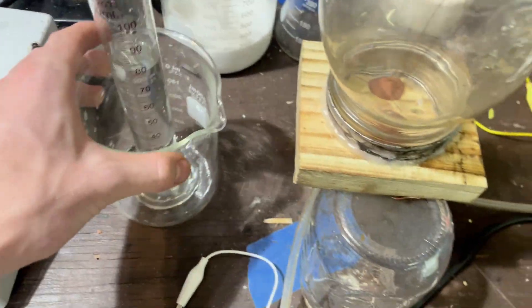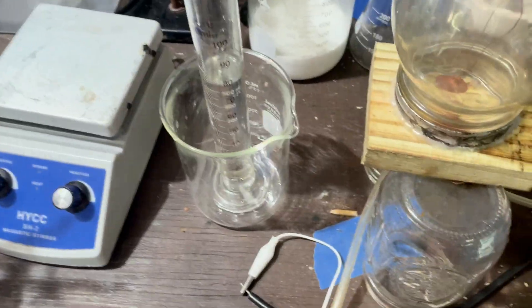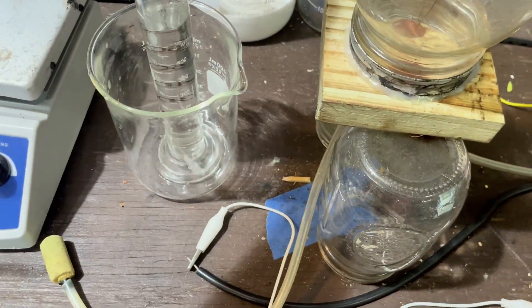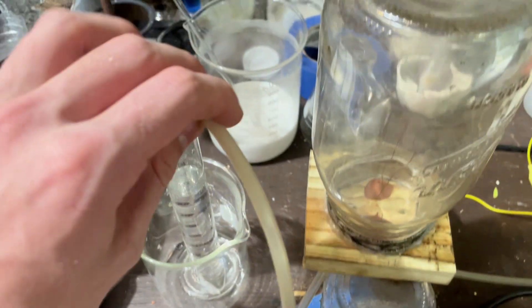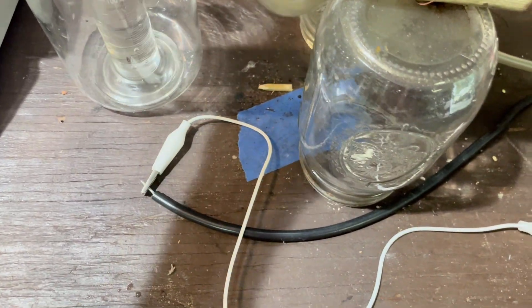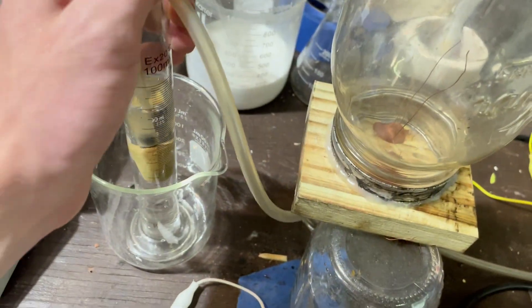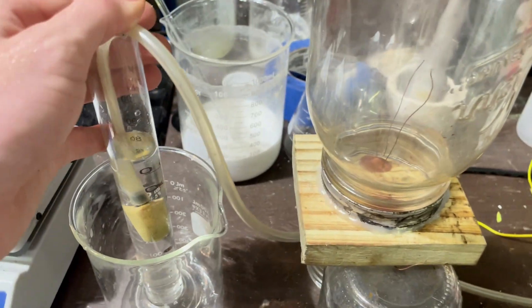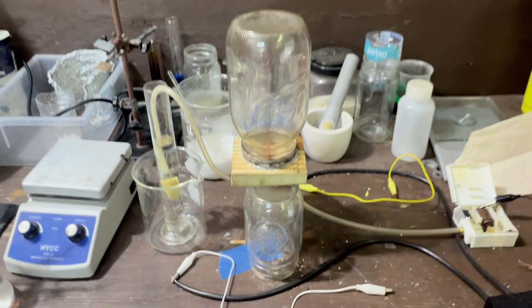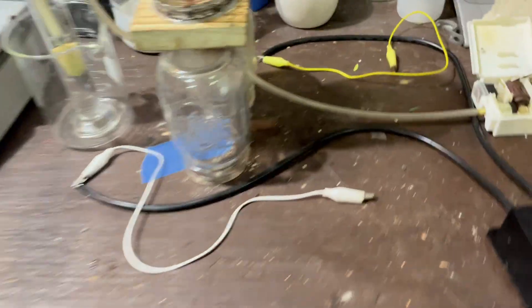I have it in here just in case it bubbles over — it's very annoying to have your acid solution spill everywhere. There is our bubble stone. This should all be set up now; I just need to give it my power. I have my outputs from my high voltage.